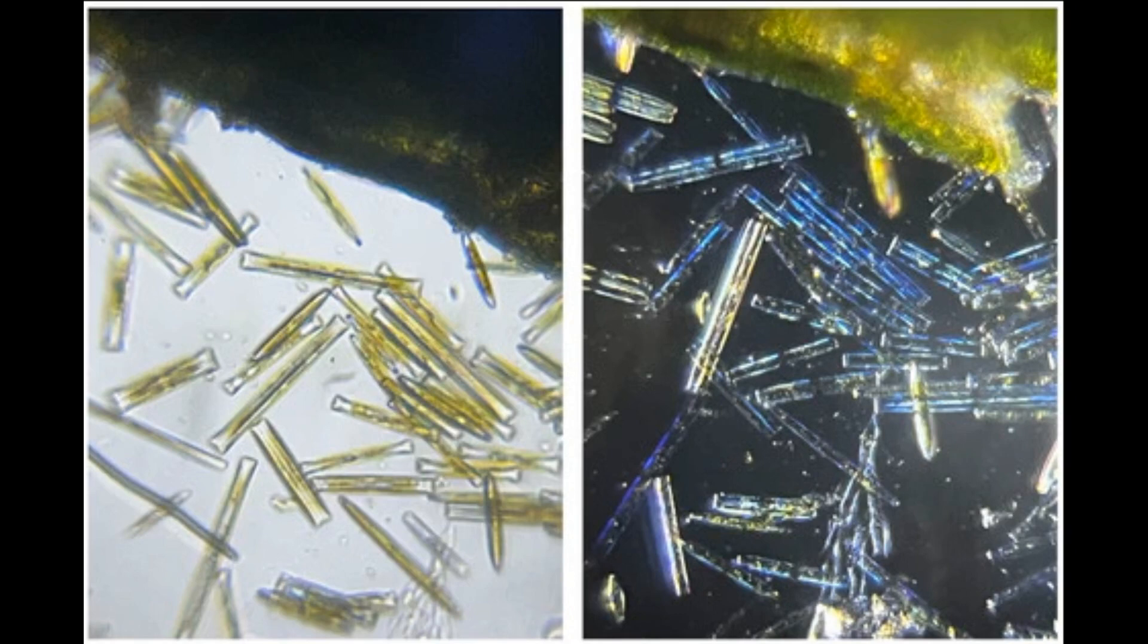Technique number one, brightfield versus darkfield. Traditional microscope viewing is considered brightfield microscopy. This means that the light from behind the slide hits the sample directly and passes through the sample and lenses to reach the eye.